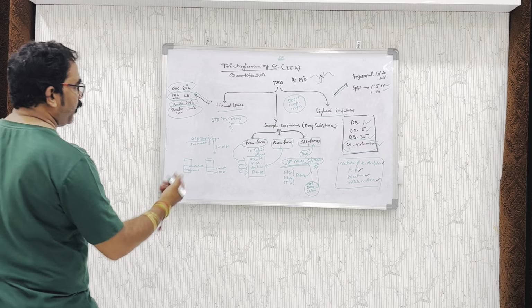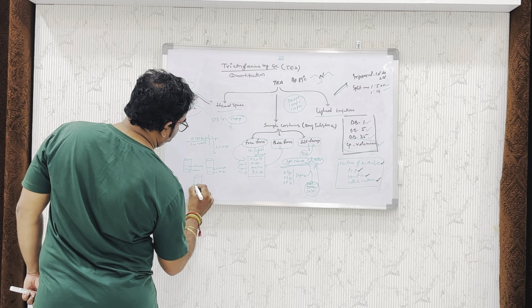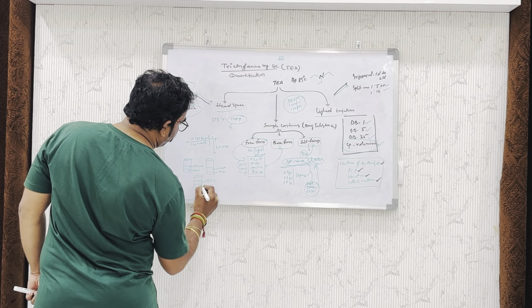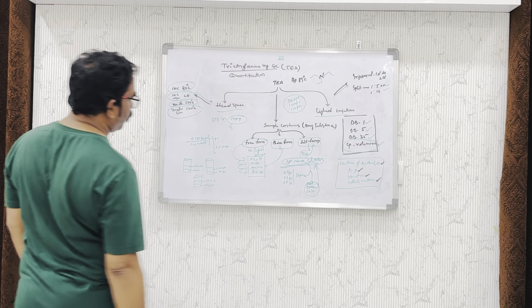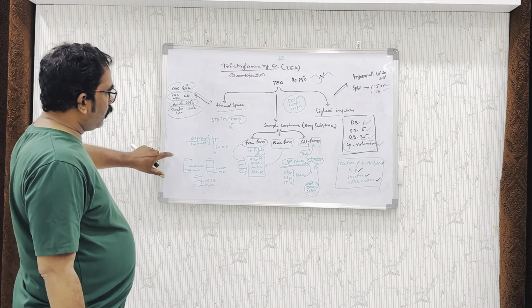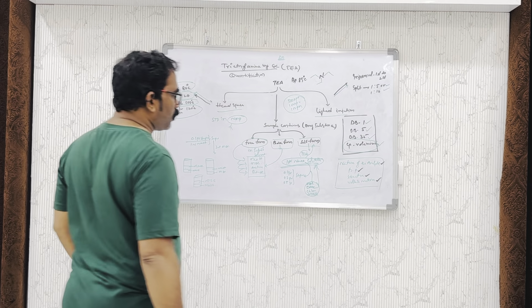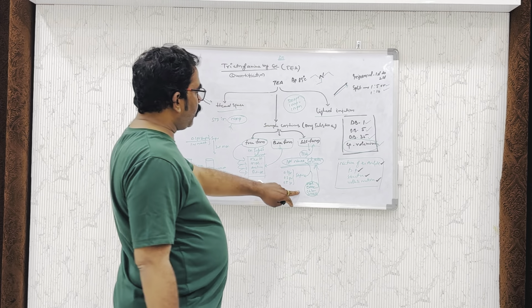If you extract with MTBE, methyl tertiary butyl ether, this is the MTBE, this is the NaOH. With these 4 solvents we can extract the triethylamine for the quantification of triethylamine when it is present in the sample. This is the basic form.